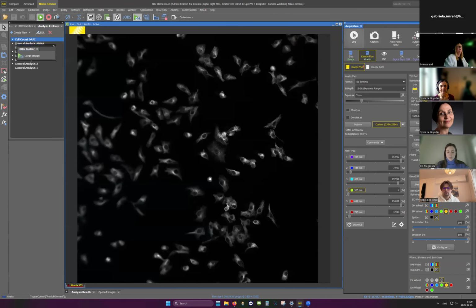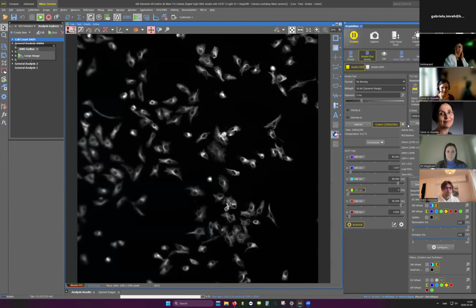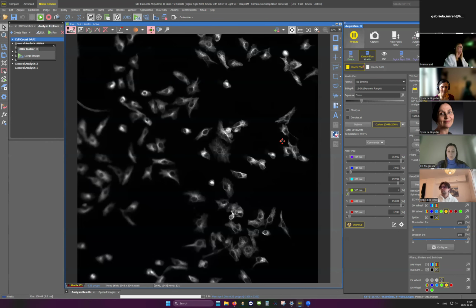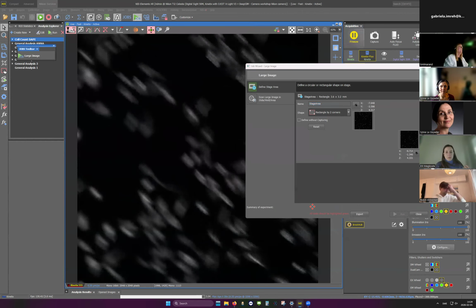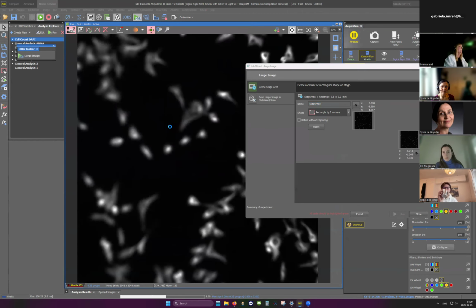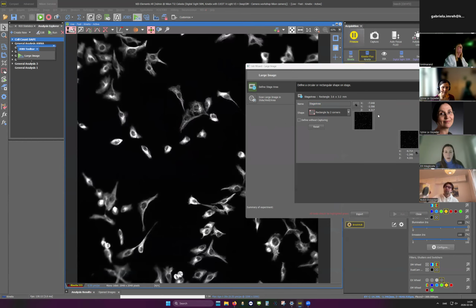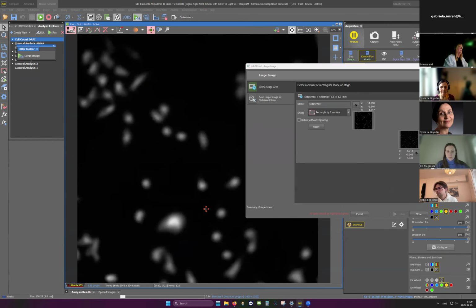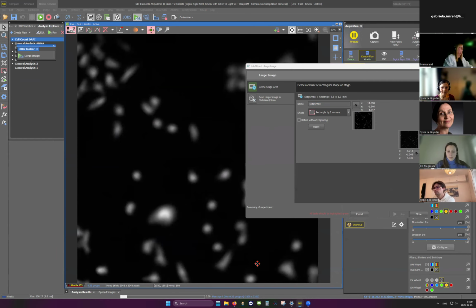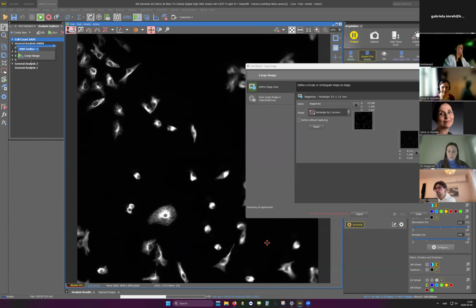I'm going to adjust the camera ROI here. So let's go for 2048 by 2048. You can see that we have a smaller field of view, and I will just run the large image from here. I just need to redefine a few positions here because I have removed the sample ones. So let's set a corner there, and let's go diagonal and take another corner a little bit more. It's not that flat, this sample that I have borrowed. This is what I'm seeing, that the sample is very slanted.